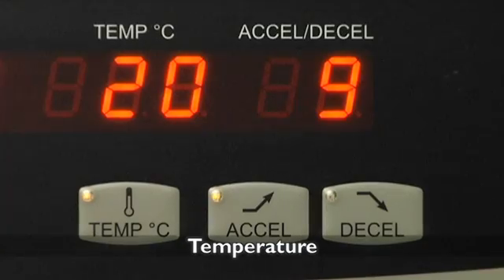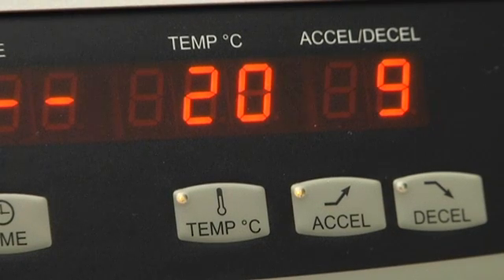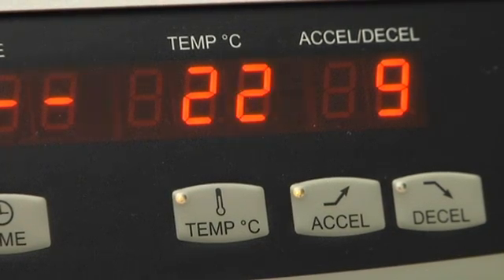On refrigerated models, select temperatures from minus 20 to plus 40 degrees Celsius and start your runs faster with a pre-cooling time from room temperature to 4 degrees Celsius that is less than 10 minutes.